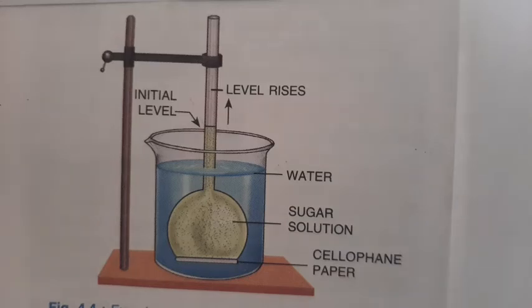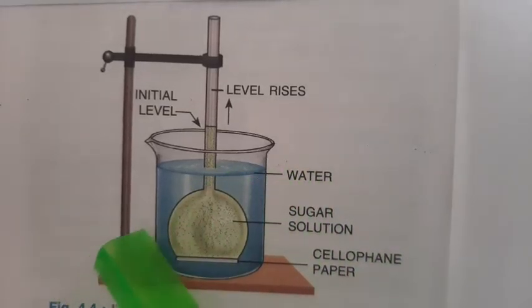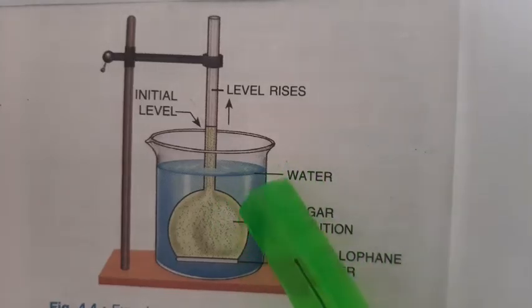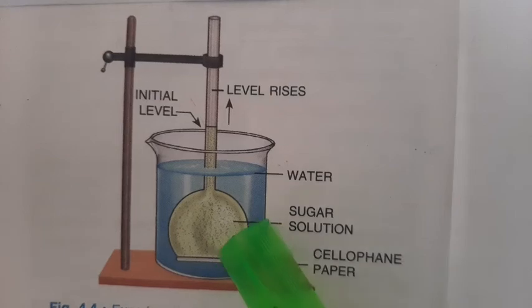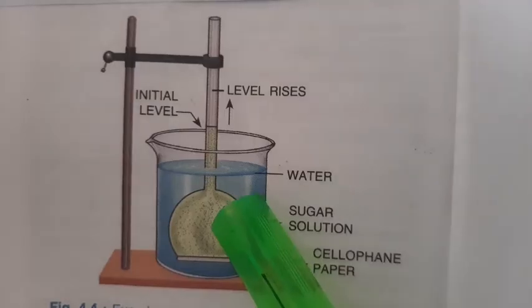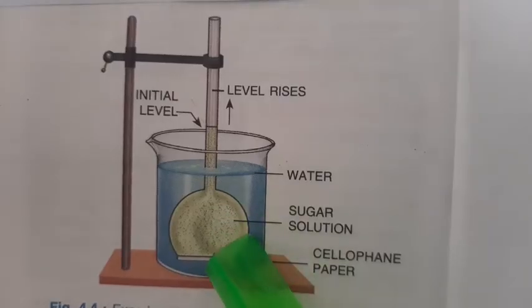Hello children, let us do an experiment today. This experiment is to demonstrate osmosis — to demonstrate how osmosis takes place. What we are using here is a thistle funnel and a beaker. At one end, the mouth of the thistle funnel is closed with cellophane paper, and inside the thistle funnel, sugar solution is taken.